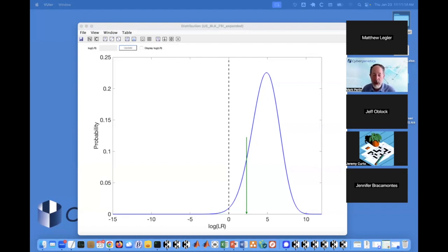It's a distribution. You see that it's to the right of 0. And in this case, there's a comparison that's made that's falling within this bell curve. And in the limit, these are bell curves, especially once you get up to 15 or 20 loci.